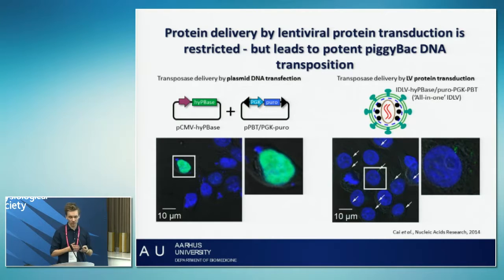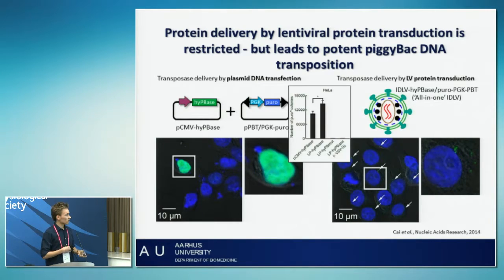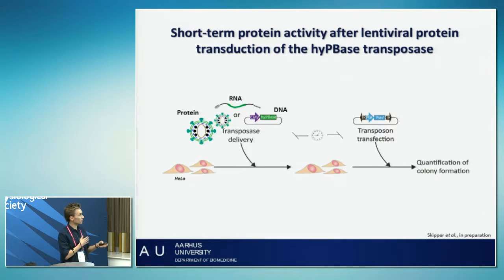So it appears as if protein delivery is very restricted after a lentiviral protein transduction. So we wanted to investigate whether this was also visible over time. Oh yeah, sorry. So these two are comparable. They were done under conditions that were comparable, so you can basically compare these two images. So we wanted to see whether the restricted presence of the enzyme also was visible over time.